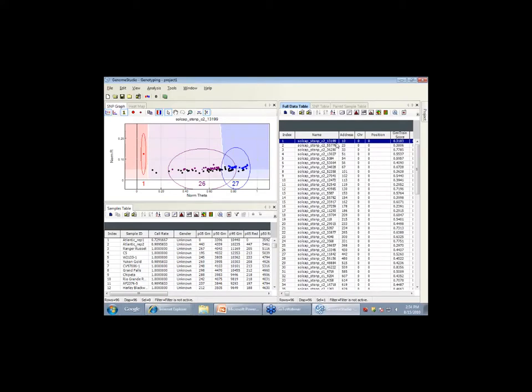And what we're seeing is the data generated from that. In this case, there are SNPs within genes, but they don't need to be. It's whatever you've submitted to Illumina to generate. It could be any SNP that you want. In SolCAP, they're all SNPs from expressed sequences. They may not be in genes. They could be 3' UTR and so on. But they are in genes, not necessarily expressed.